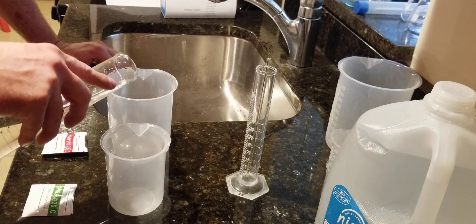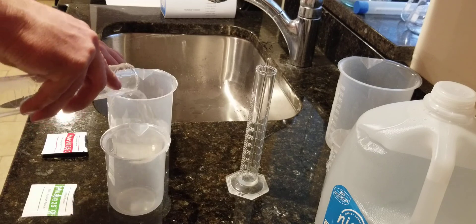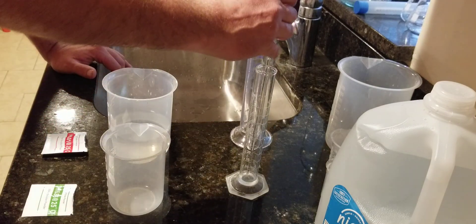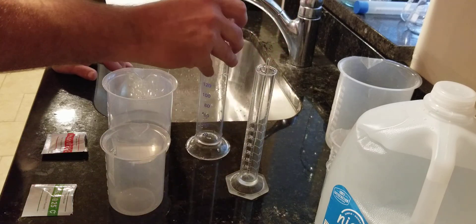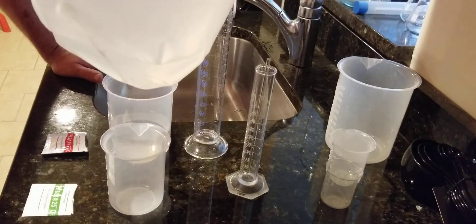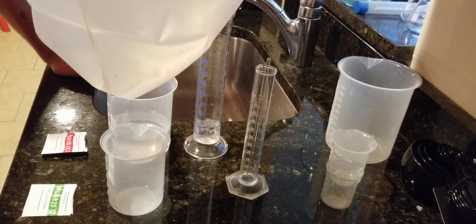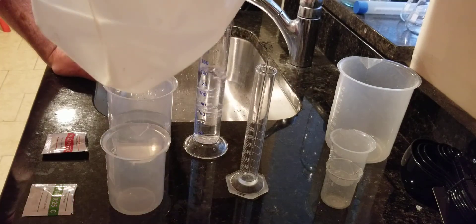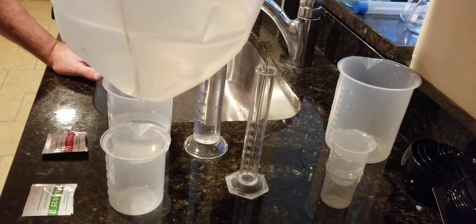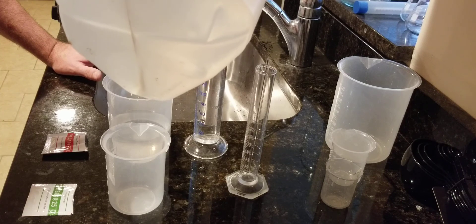What I'm doing here is calibrating my pH meter before we start testing the must, to make sure that my pH meter is reading properly and calibrated properly. That way, when we test the must, we get a correct reading when it comes to pH.